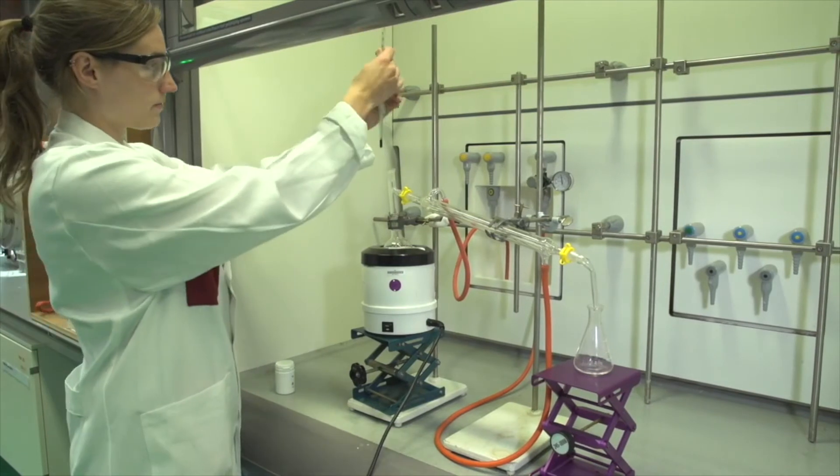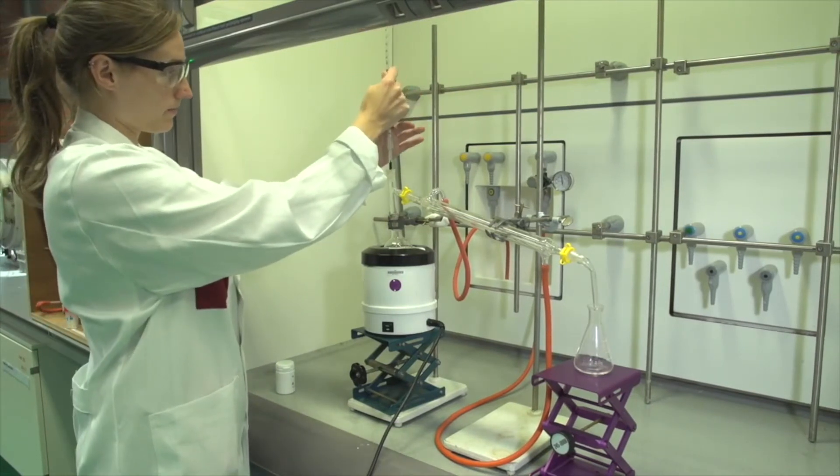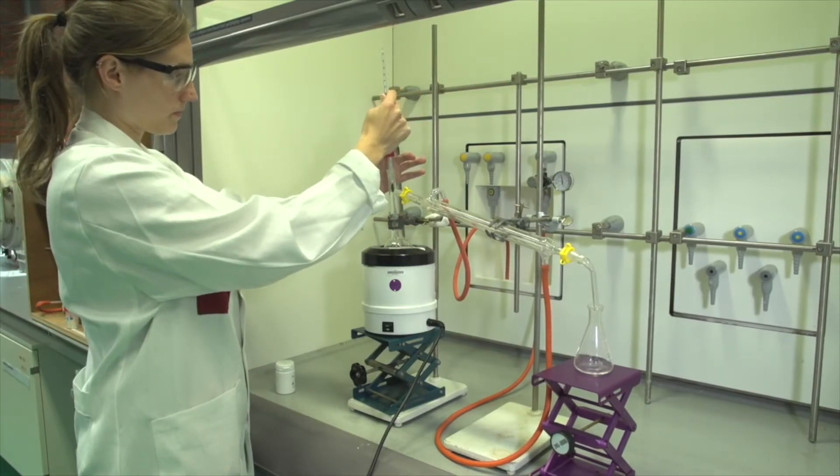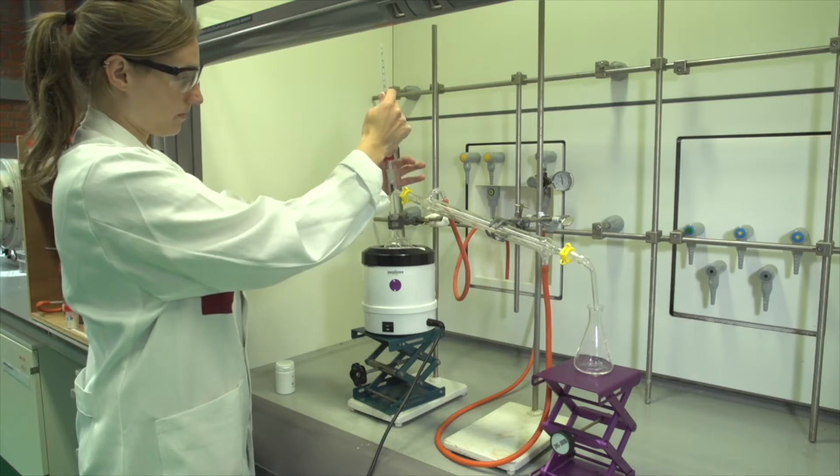Adjust the position of the thermometer on the distillation setup. Ensure that the bulb part of the thermometer lies in the T-junction area of the distilling head.